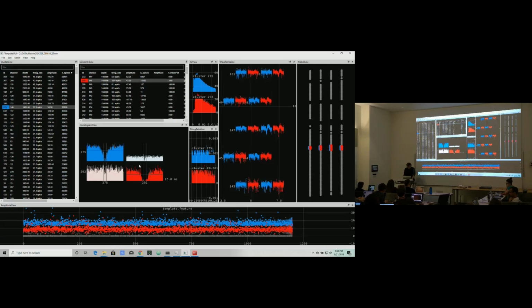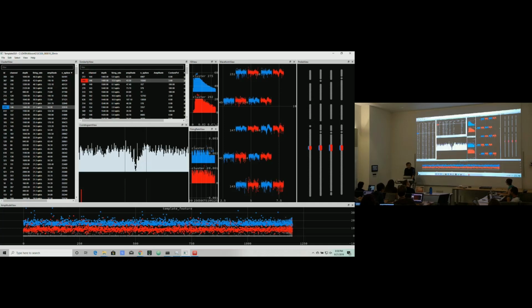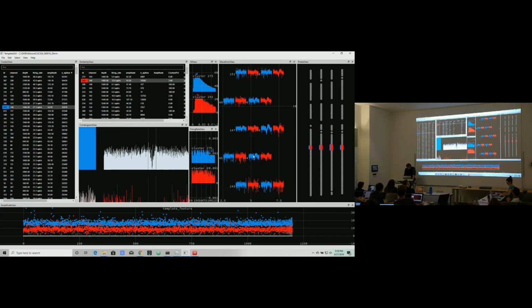Okay. All right, so what's happening, right? The blue and the red both have refractory periods by themselves, but not so much between each other, except maybe there's a little bit of something there, right? It's small, but it usually indicates there might be some trade-off of spikes between one and the other. I don't know if we can recognize that, because I now realize we have no feature views whatsoever.